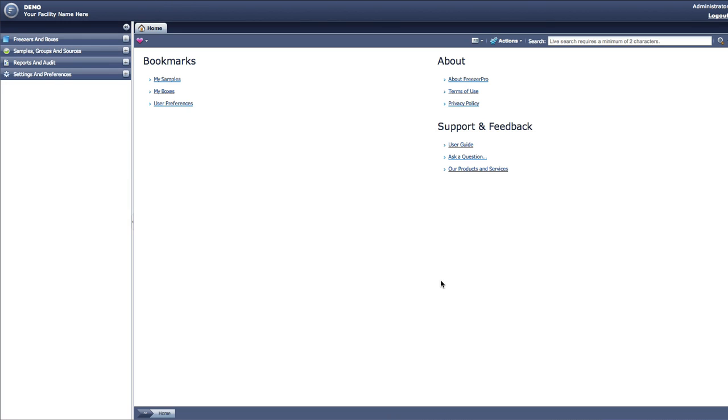This concludes the general configuration managing user preferences video tutorial. Up next, we will discuss managing the general user interface.